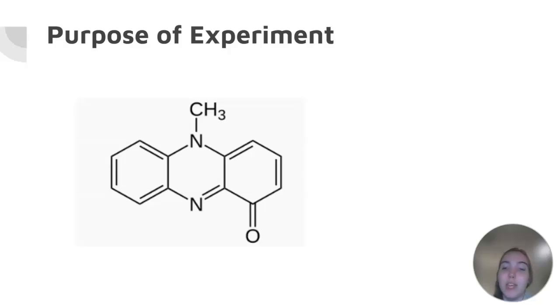Surface-enhanced Raman spectroscopy is a short, non-invasive optical technique that can be used to detect biological molecules in people's spit to tell them if they have a disease or not. This molecule right here is the one we were testing for. It's called pyocyanin, and it is a biomarker for an antibiotic-resistant bacteria. So we can use it as a model to show how this technique can be used on other diseases.